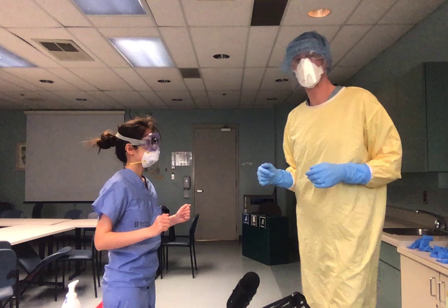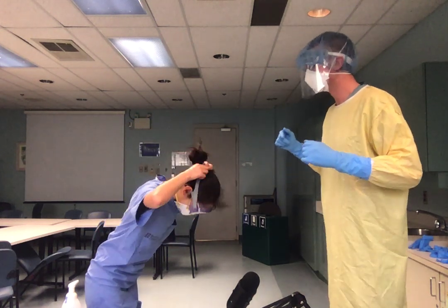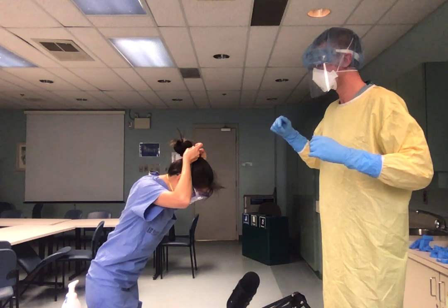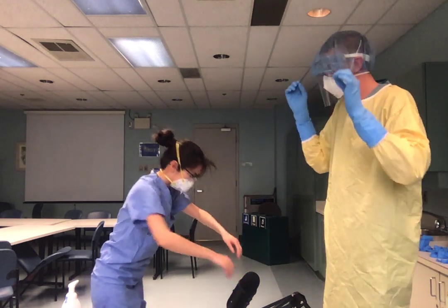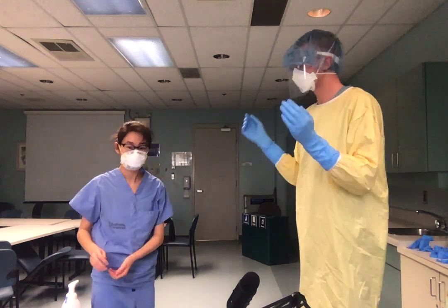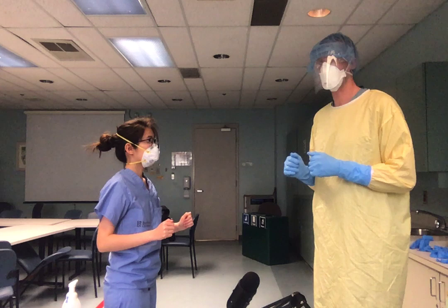Perfect. Now we're going to go for those goggles. So same thing, we're hinging at the hips, Nancy. Very good. Grab that strap. Perfect. She's grabbing from the back, so she's not taking her goggles off like a pair of glasses. Okay, you're going to wash your hands again, Nancy. Excellent. So the last thing we have left is that N95.